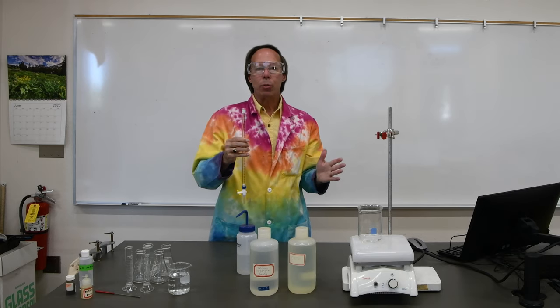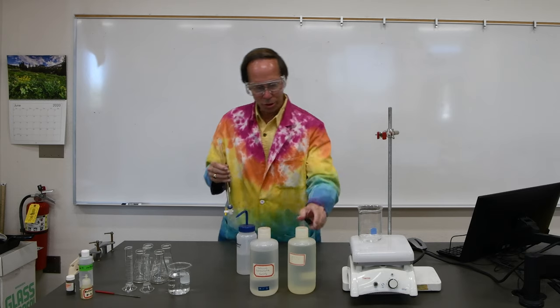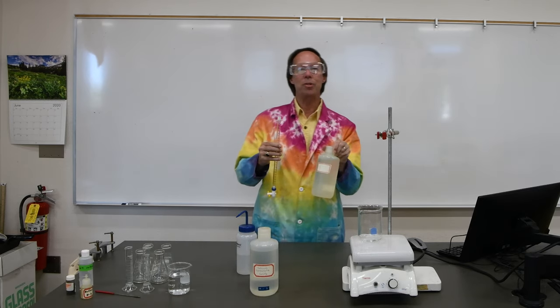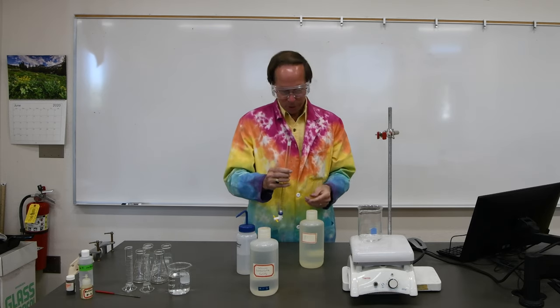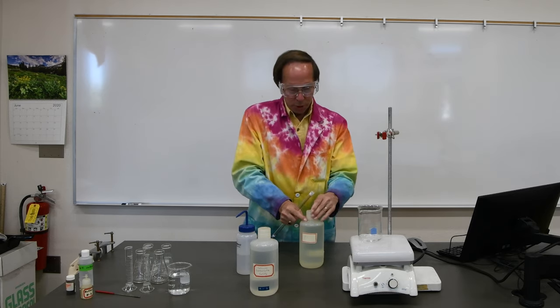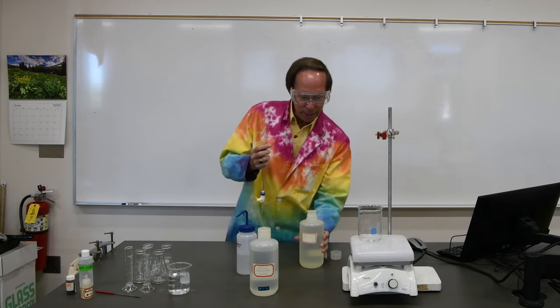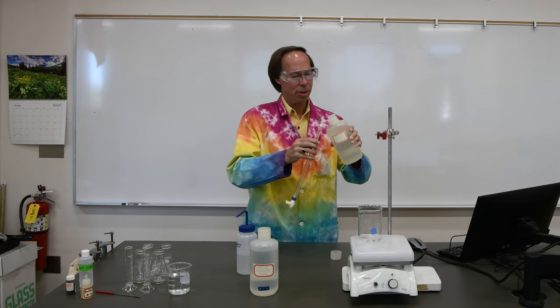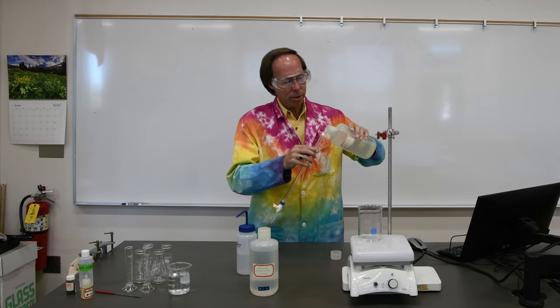The titrant, or the substance we're going to be using that has a known concentration, is called EDTA, ethylene diamine tetraacetic acid. It happens to love calcium. So in the burette, we're going to be putting EDTA. This EDTA has been prepared to have a very specific concentration. So we're going to carefully add some EDTA to the burette.